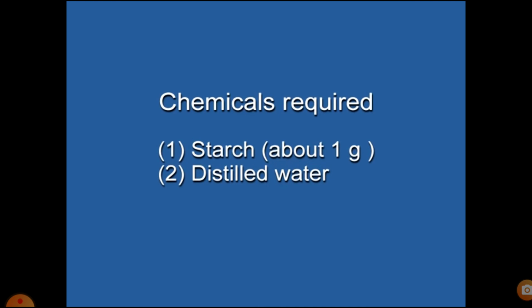For preparation of lyophilic sol of starch, chemicals required: 1 gram starch, and distilled water.